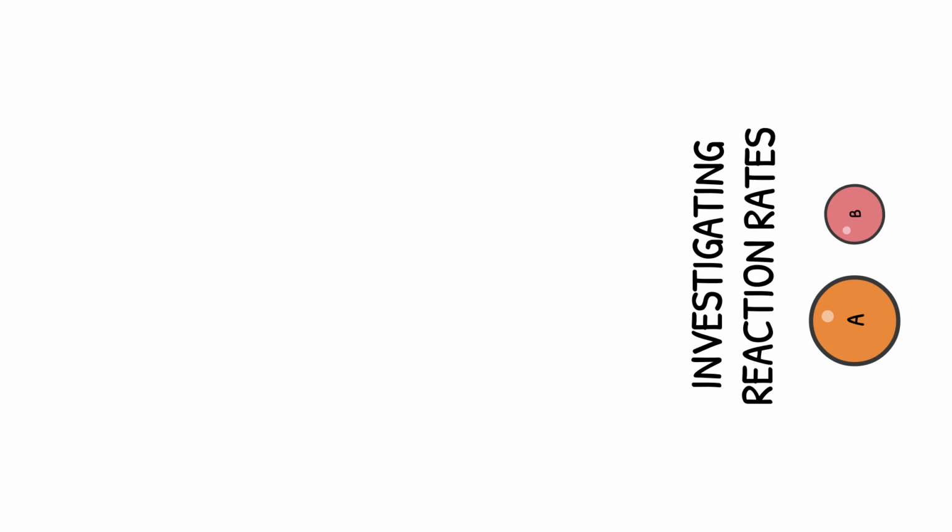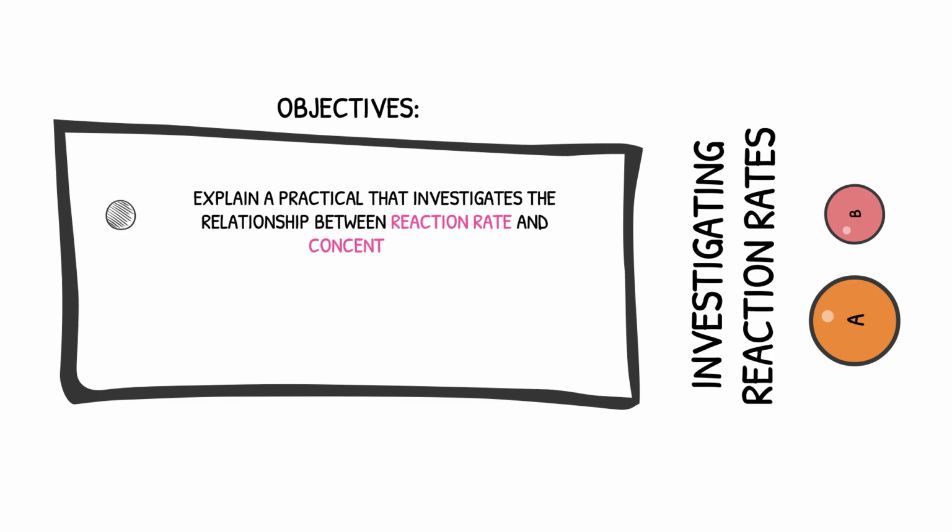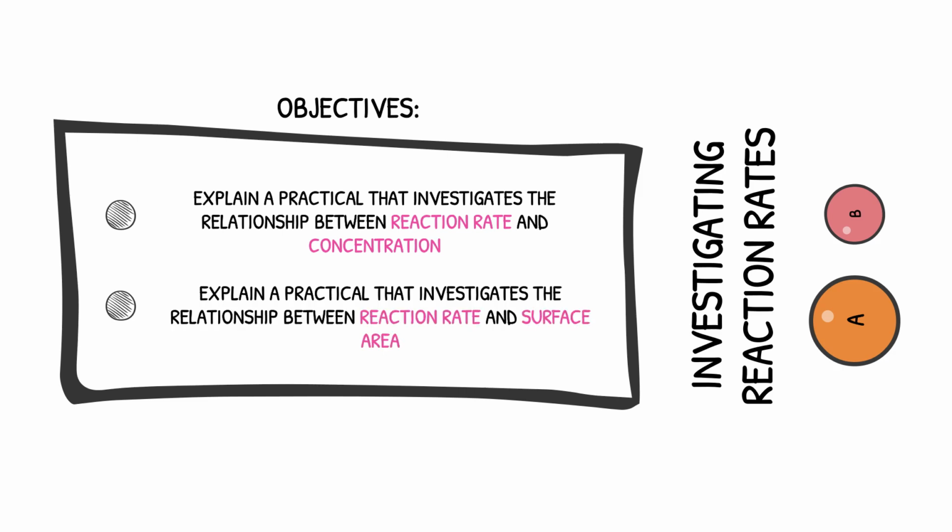In this video, we are looking at the core practicals for investigating reaction rates. By the end of this video, you should be able to explain a practical that investigates the relationship between reaction rates and concentration, and explain a practical that investigates the relationship between reaction rates and surface area.